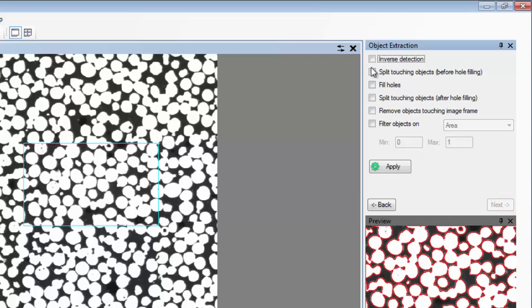We can then use an automatic threshold to select just the bright objects. Following this, we select the functions that separate touching objects, fill in holes and remove objects touching the edges.